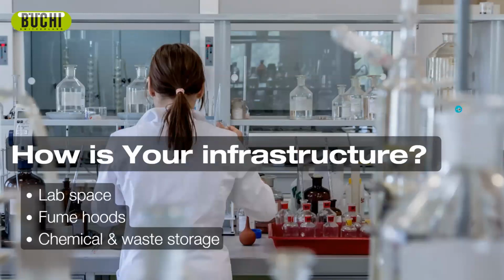All right. Thanks for that, Ryan. And next we'll take a look at the question of how is your infrastructure? Since the infrastructure required for a benchtop NIR is just some real estate on the lab bench, the bullet points here on this slide really just apply to Kjeldahl. So if you want to bring Kjeldahl in-house, you'll need, of course, some lab space. You'll also need some fume hoods and proper space and systems for chemical and waste storage. So if you don't already have that infrastructure in place, you'll need to consider whether you can add them or need to look at alternatives to protein determination by Kjeldahl.